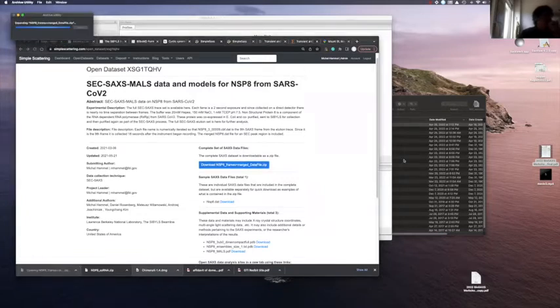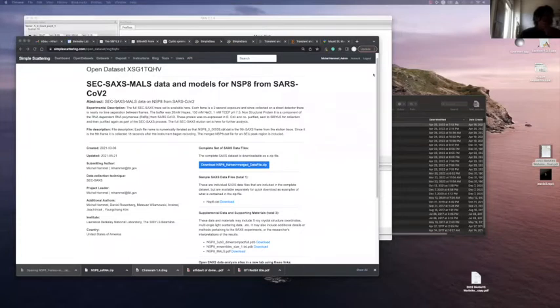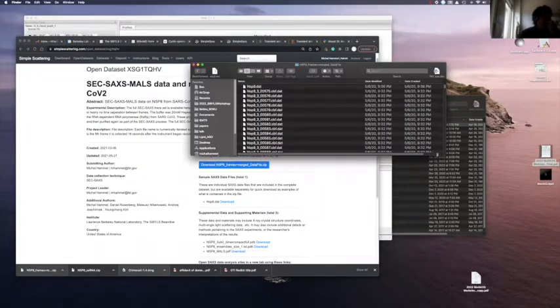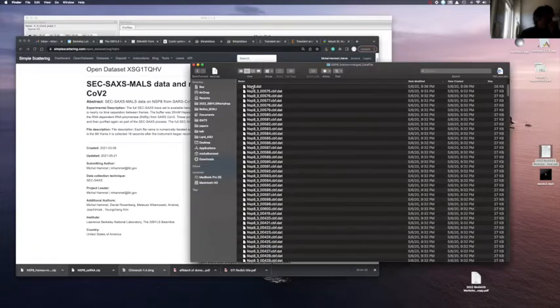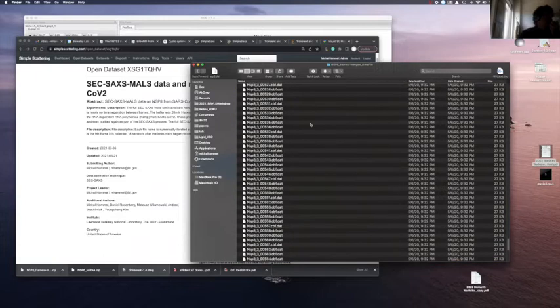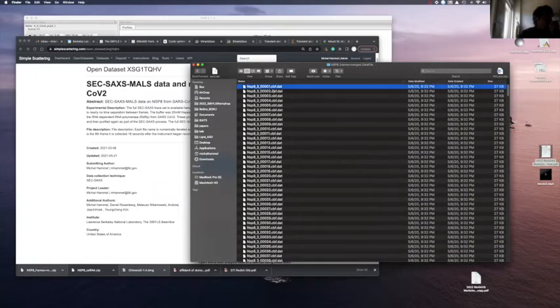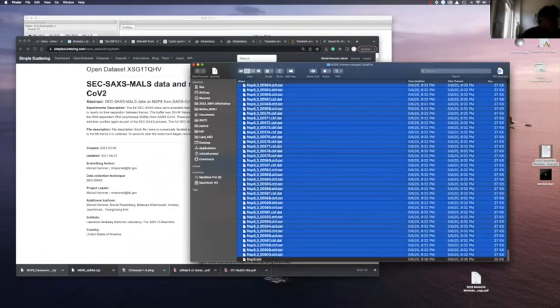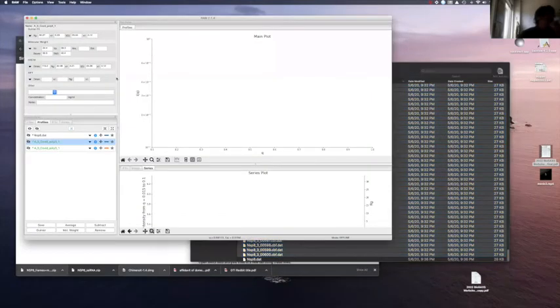And when you open the zip file, you will see that there is, unfortunately, also inside this file what is the final merged data. But what you are interested in, what you really want to analyze in RAW, are those 1 to 600 frames. Those are the single frames for our elution. Every frame is a 2-second exposure across your elution.